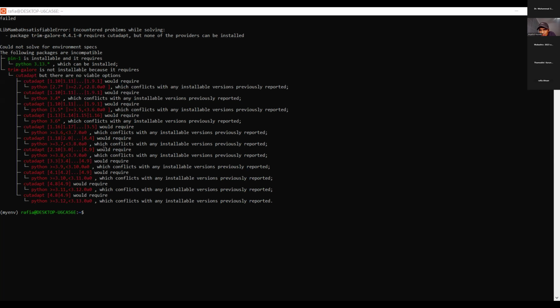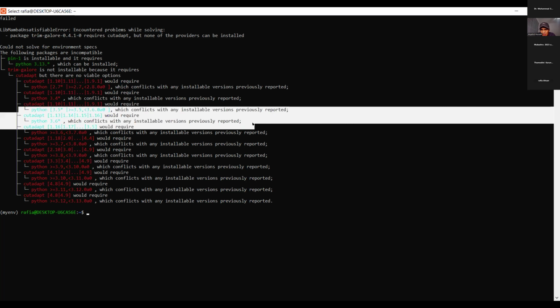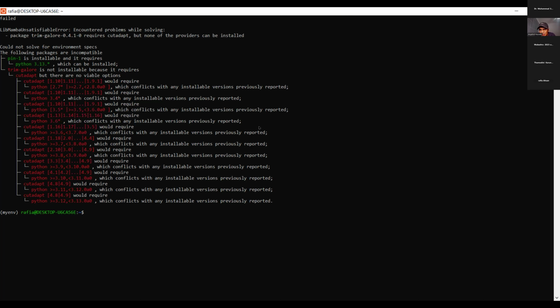Okay, the next thing we require is cutadapt, Python 2.7, Python 3.4, cutadapt 1.16. Okay, Python 3.8 is conflicting with other. Okay, okay. No, I can fix it. Let me write another code. Okay, sir.